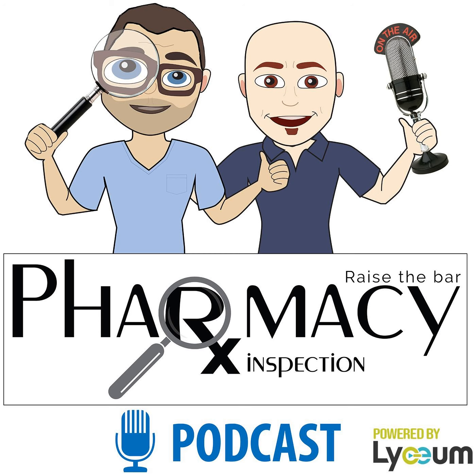Remember, these were found in the ISO Class 5 engineering control, which is supposed to be extremely clean and basically free from microorganisms at any given time. So this could also suggest that maybe there's something wrong with their engineering control as well, as it should be actively pushing microorganisms out of the hood. In the post here, I've put in a cause and effect diagram, otherwise known as a fishbone diagram or Ishikawa diagram, for looking at possible causes of contamination.